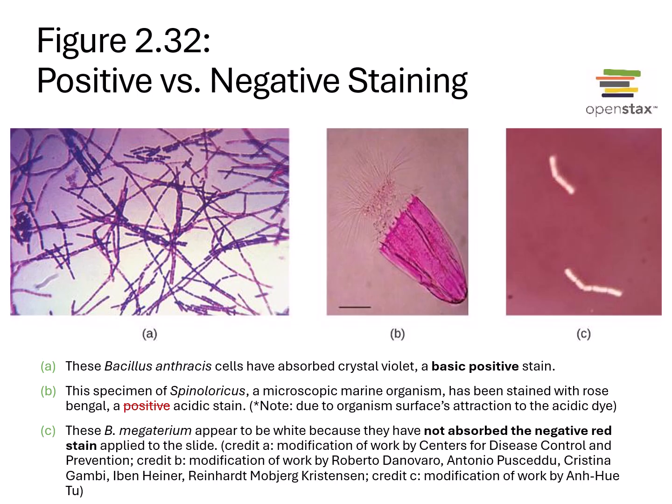On the left we have cells stained with crystal violet, which is a basic stain. Remember in chemistry, bases accept protons, and that's why they become positively charged. This positively charged stain will bind to negatively charged cells. On the far right, we have some kind of negative acidic stain. Remember, acids release protons and become negatively charged. Cells are also negatively charged, so they're going to repel each other. So that stain binds to the glass slide, which is positively charged, but not to the cells.